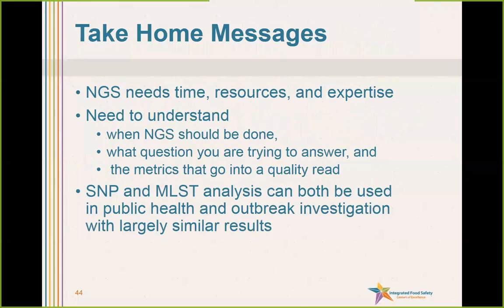So in summary, the generation of sequence data that will be used by epidemiologists involves both hardware technology as well as fairly complex bioinformatics analyses. Epidemiologists will not have to know the details of the genome assembly and SNP detection process, but they should know that the specifics of the analysis affect conclusions, and they should be prepared to ask questions about sequence data.